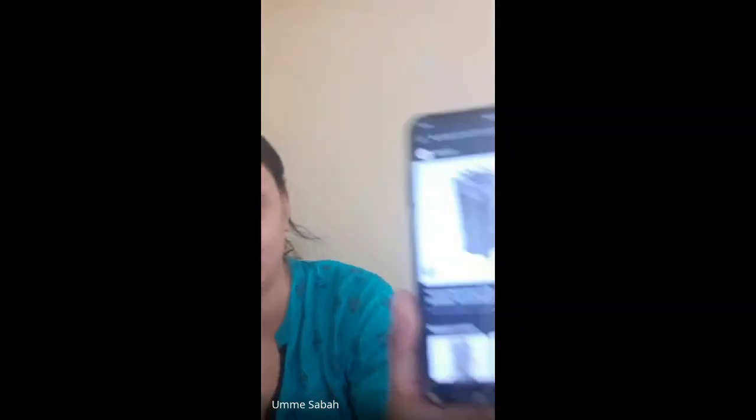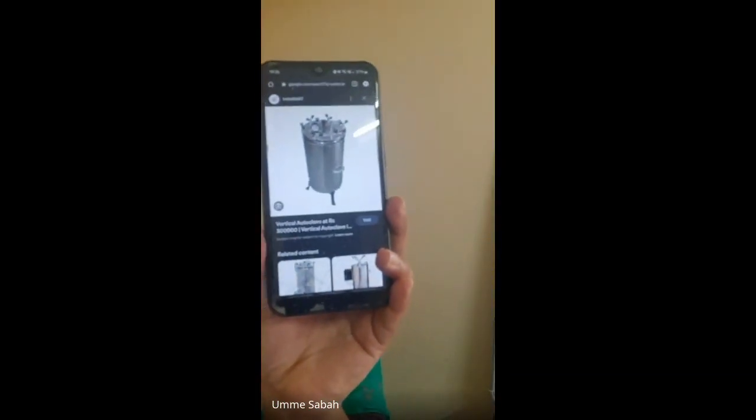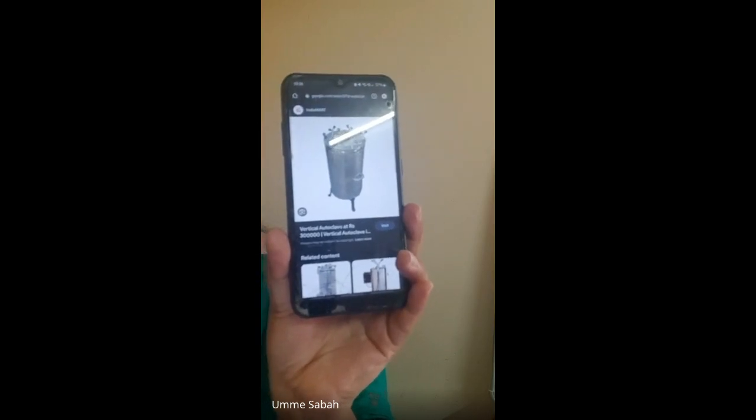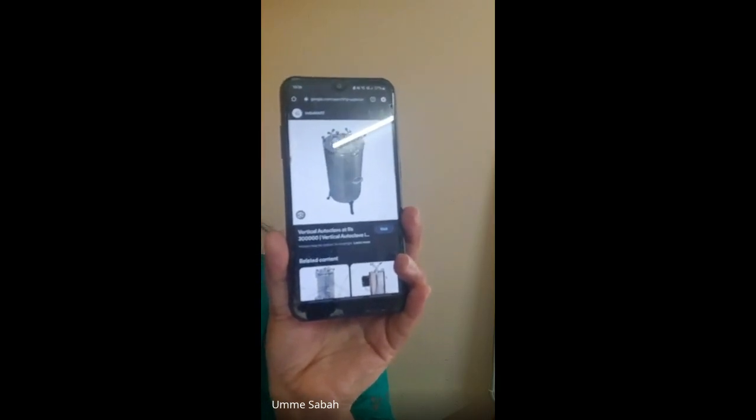Okay. So for media preparation, we want distilled water. Distilled water is a must. Without distilled water, we cannot do it. This is the autoclave, sir. This is how the autoclave is. So incubator and hot air oven, they look the same. What we have in our lab, they are like that only. All right. So these are some of the important apparatus.